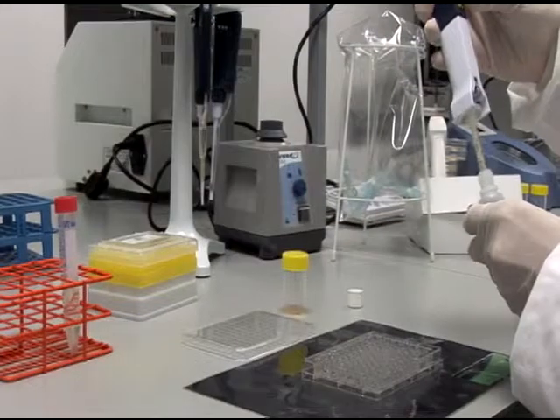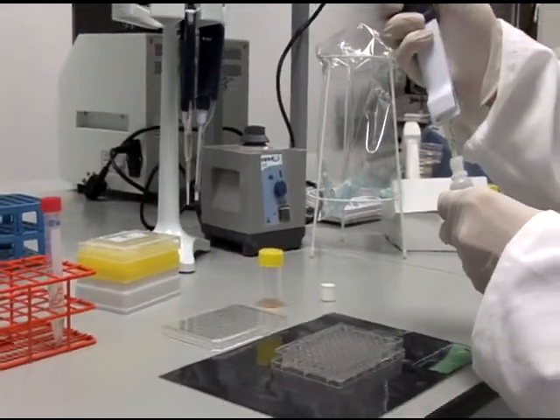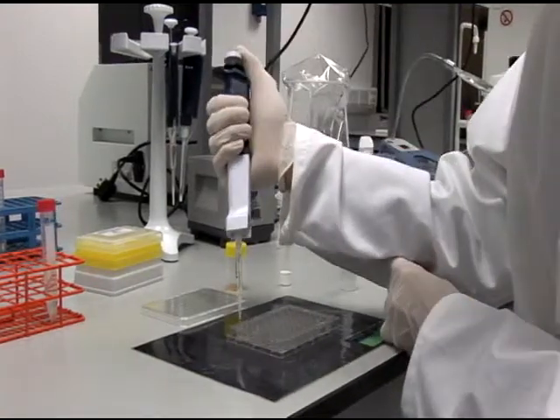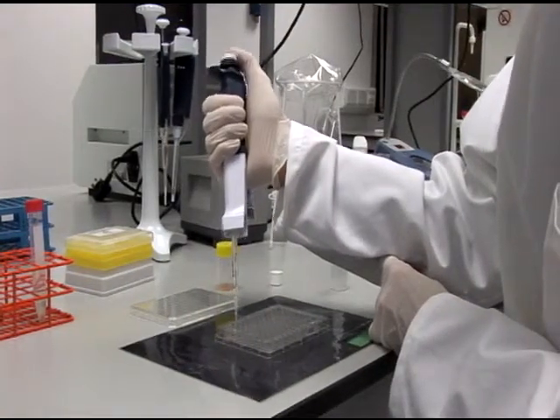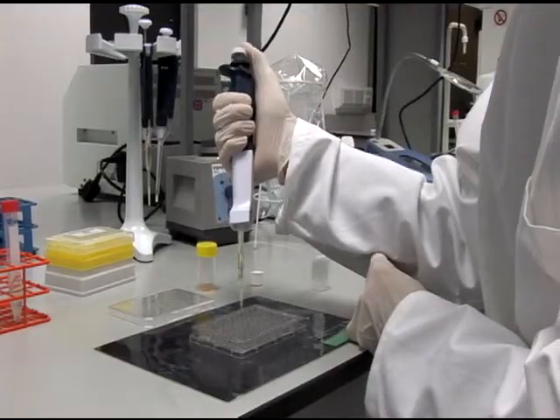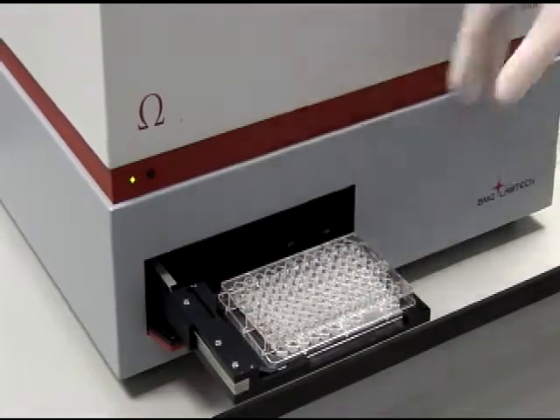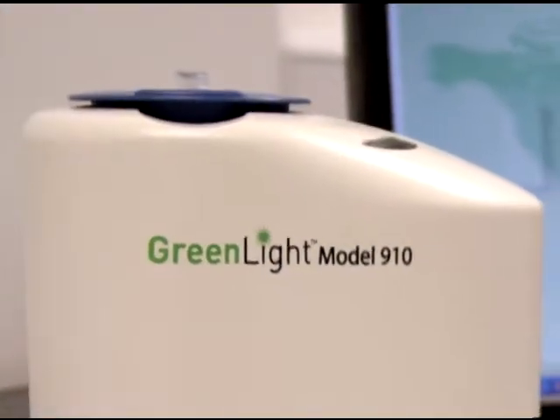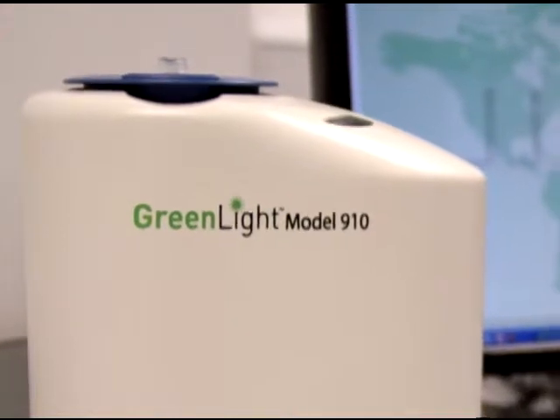The Greenlight 960 is a simple mix and measure assay. Using a 96-well plate, pipette in 100 microliters each of the sensor reagent, food homogenate, and mineral oil. Load the plate into the reader and you're done.